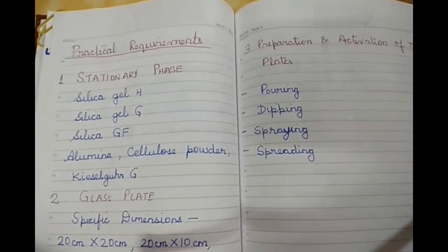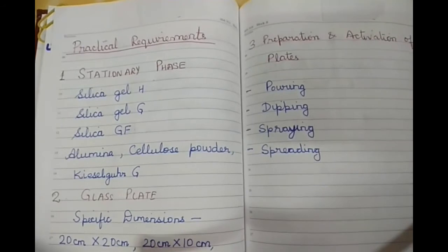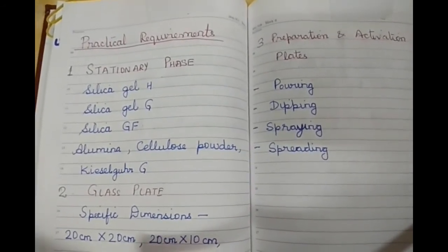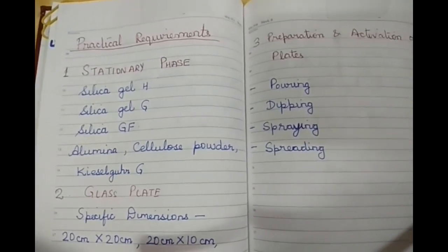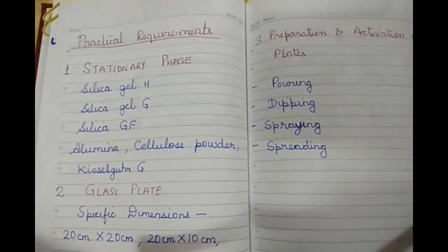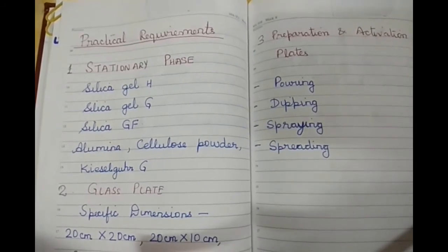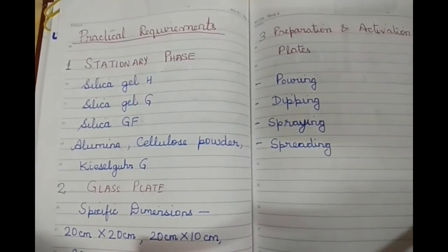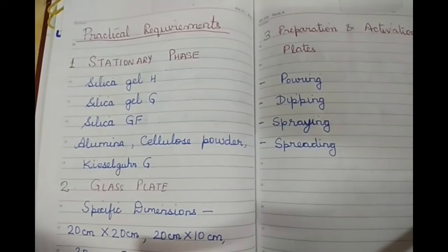Now the practical requirements of stationary phase are silica gel H, which comprises of silica gel without binder. Then it can be silica gel G, which is silica gel plus calcium sulfate. Silica GF, that is silica gel plus binder plus fluorescent indicator. Then it can be alumina, cellulose powder, and so on.